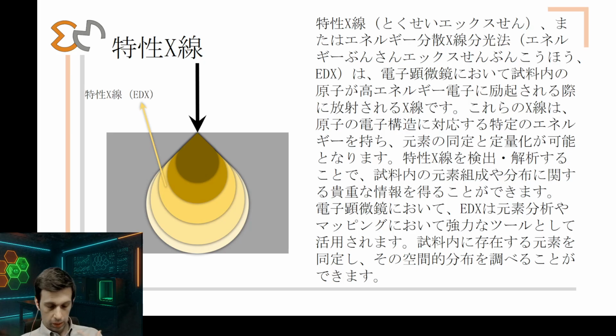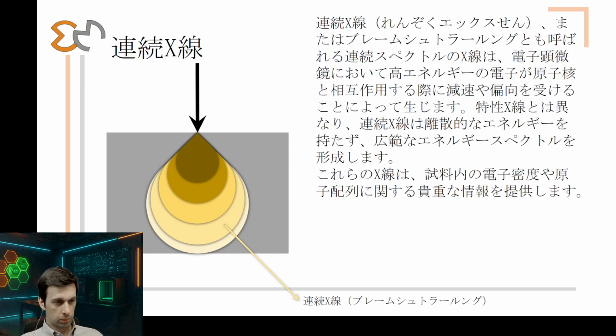And this allows us to make a good elemental analysis. So we collect the X-rays emitted, and we can say what the elements are that are present inside of the material. Not much about their crystal structure, etc., more about the composition. Sorry, not the energy.